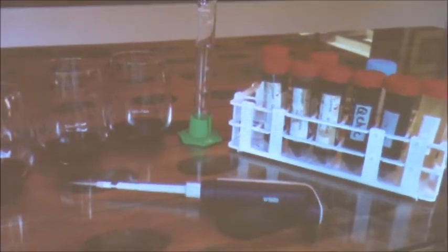And it takes 1,000 microliters to make 1 milliliter. So when you're doing these trials, you can see the small volumes that you're dealing with. And you guys have small volumes of wine. You don't want to be taking a liter of wine every time you do a trial and just trialing something. If you can put something into 50 milliliters of wine, and taste it and know, yeah, that's what I want to do to my wine.